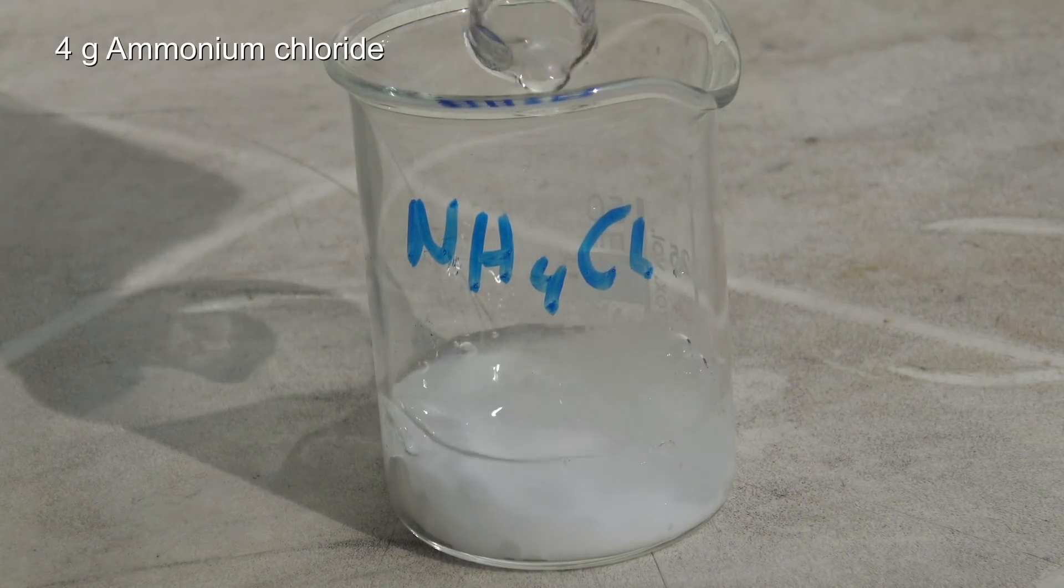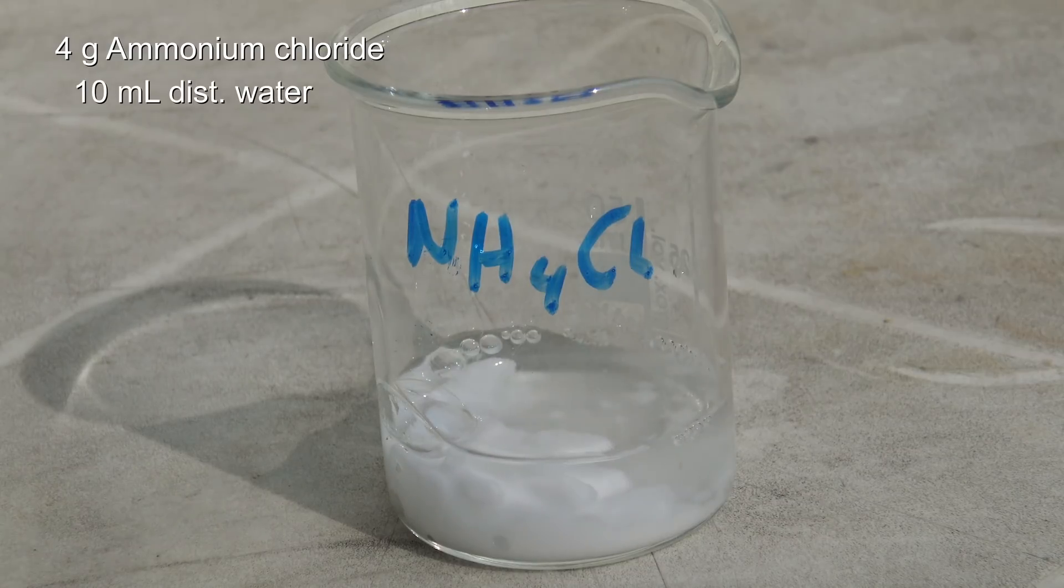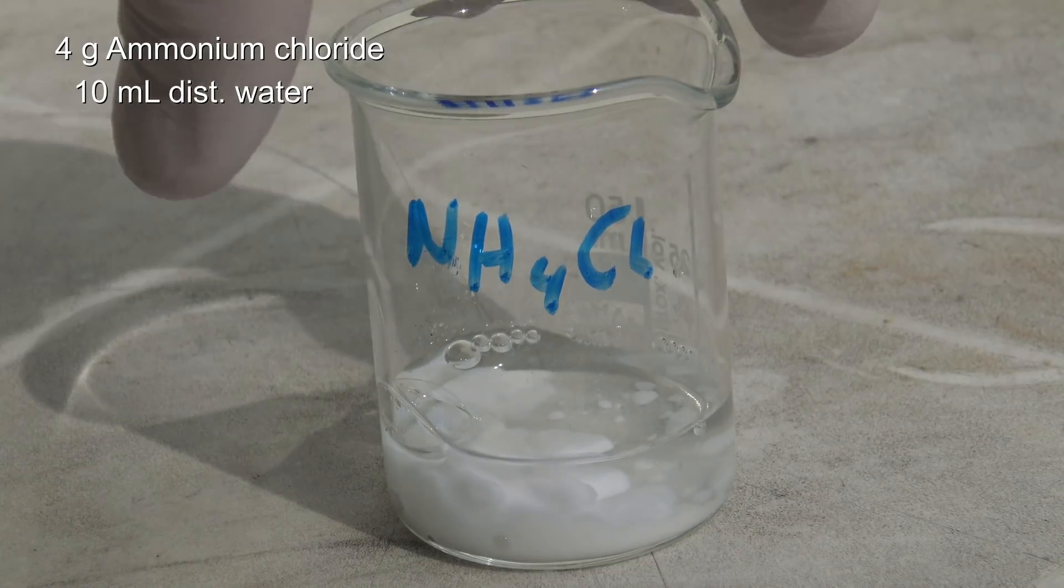At first, 4 grams of ammonium chloride are mixed with 10 milliliters of distilled water to prepare a saturated solution.